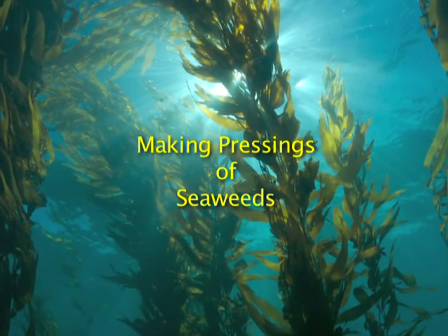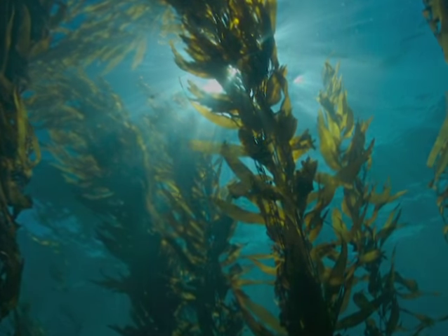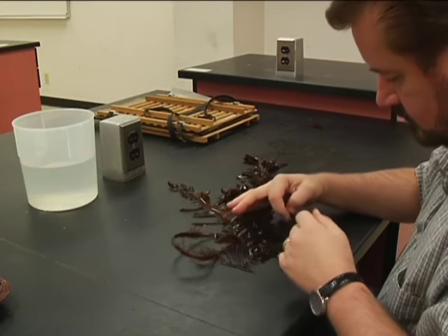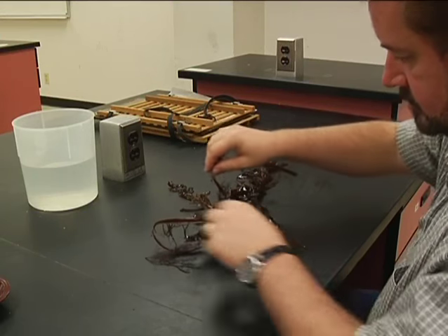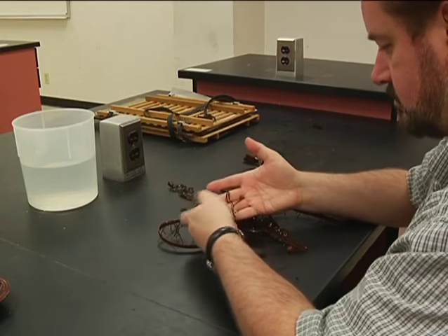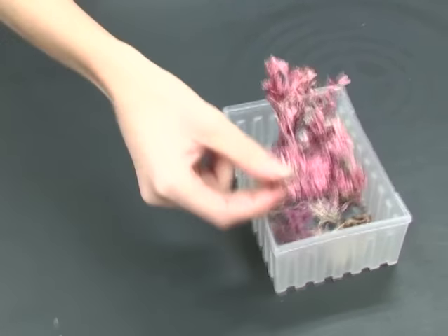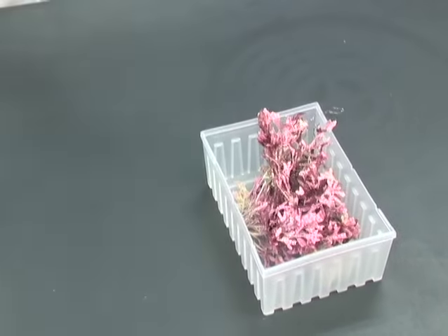Making Pressings of Seaweeds. Sort and clean your algae. Find a suitable size specimen that fits your paper. Crustose and coraline species are usually air dried without pressing and stored in containers.